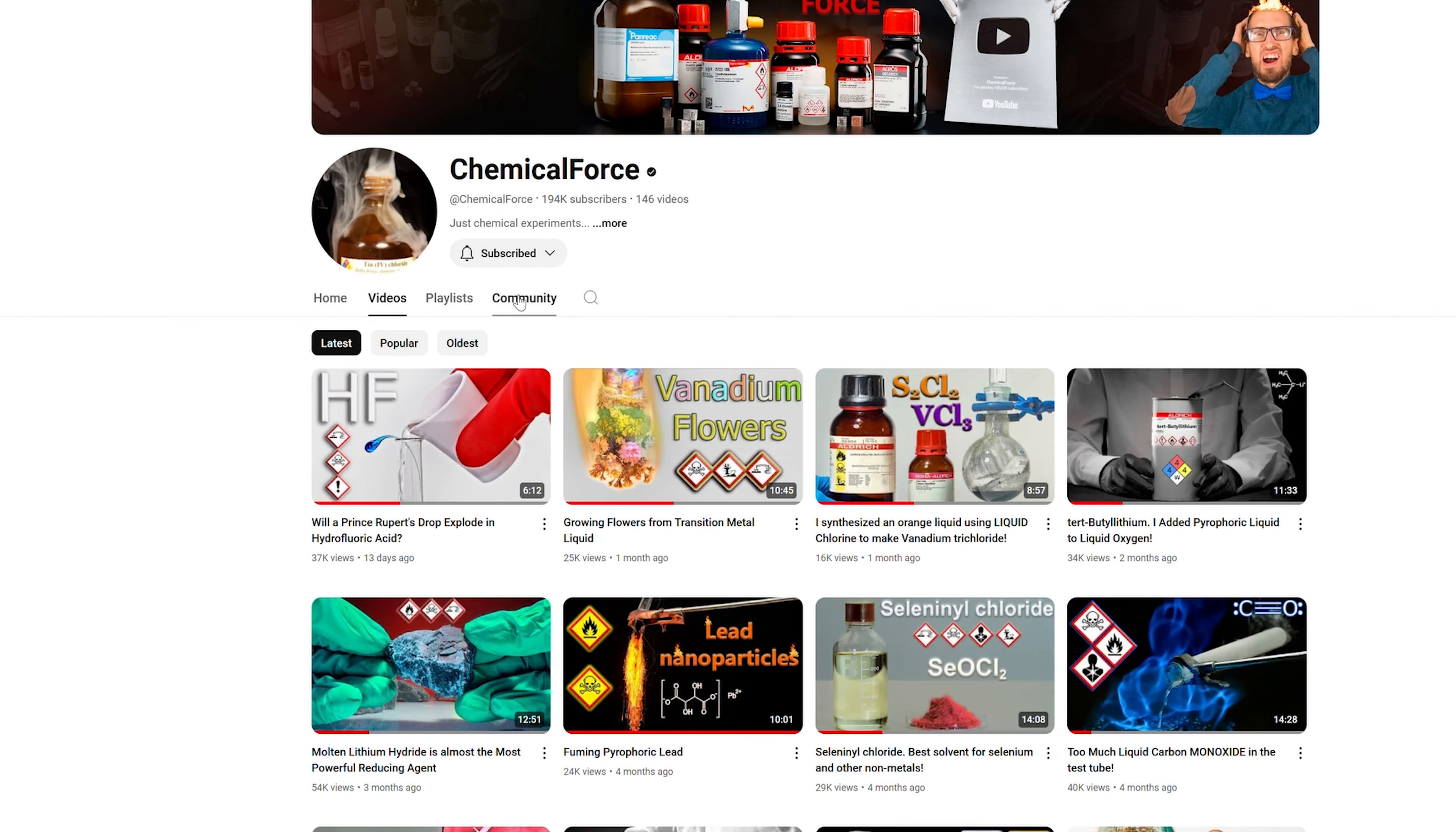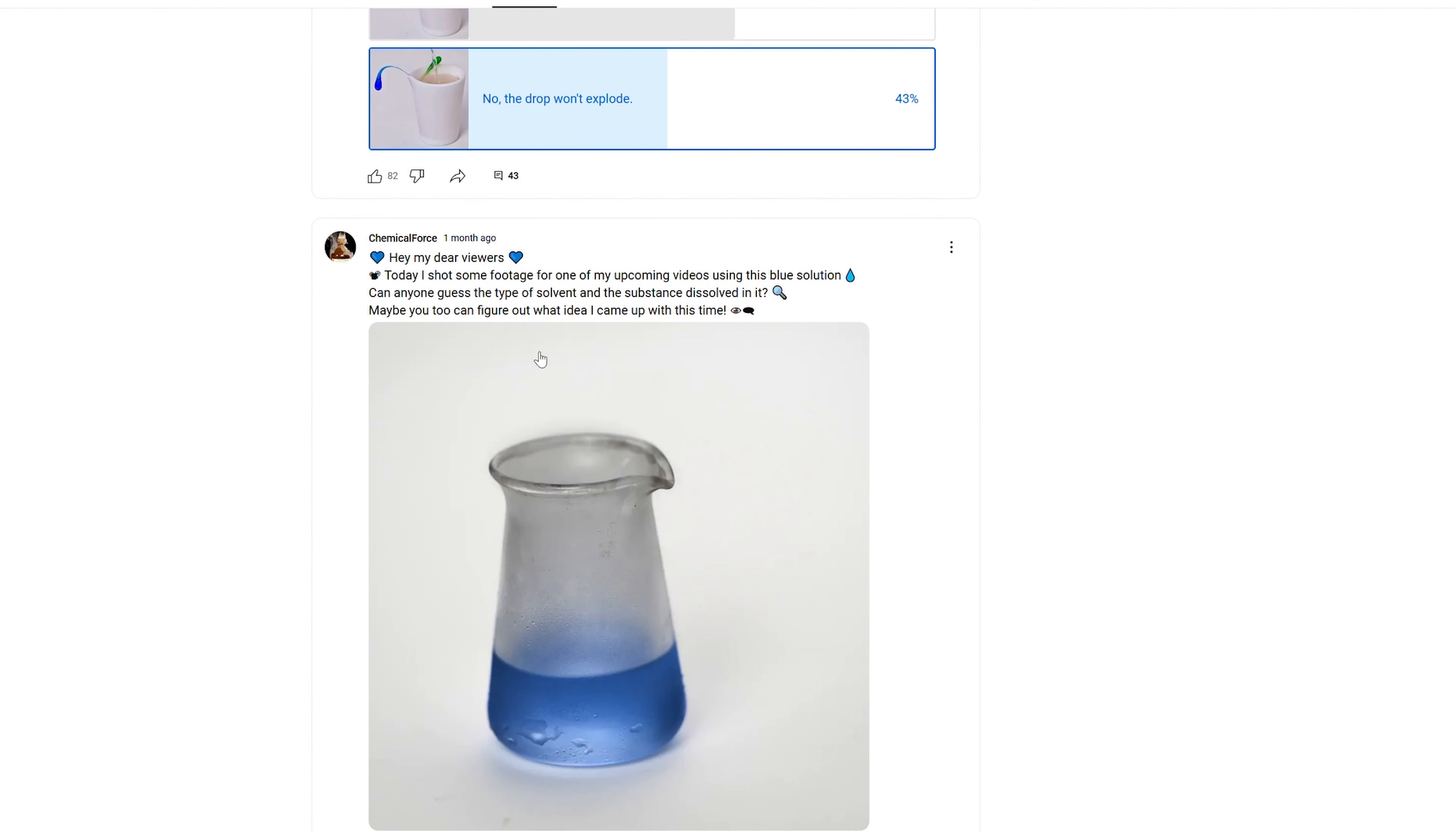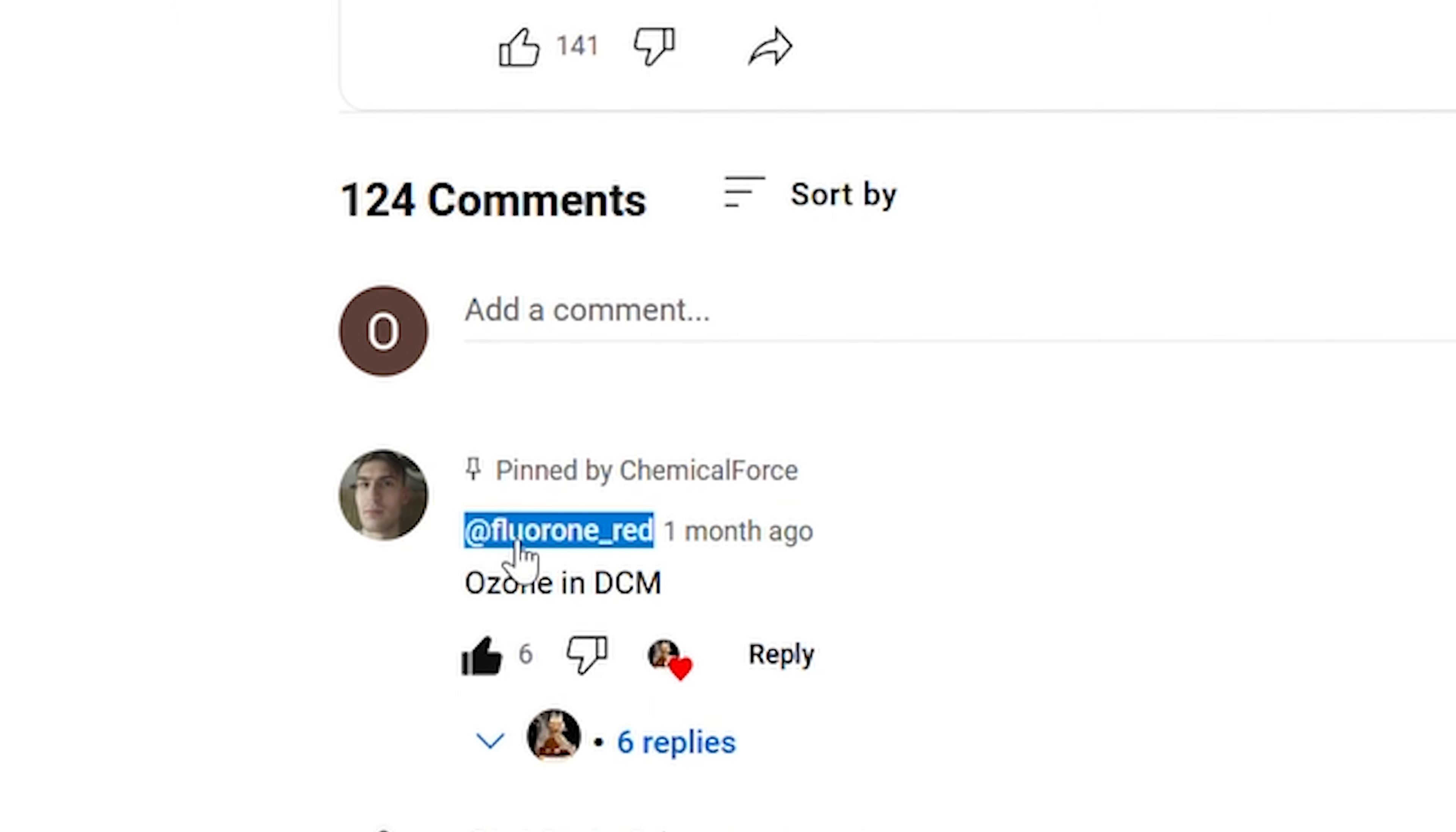Recently, I asked you in the community tab to guess which blue solution I'll be using in one of my upcoming videos. There were lots of guesses, but the first person to correctly identify the solution as cold ozone dissolved in carbon tetrachloride was fluoron red.